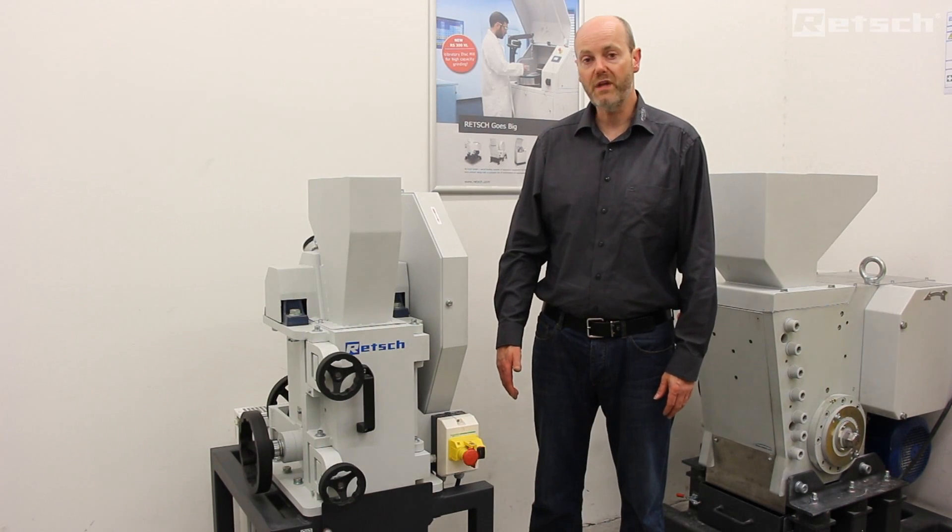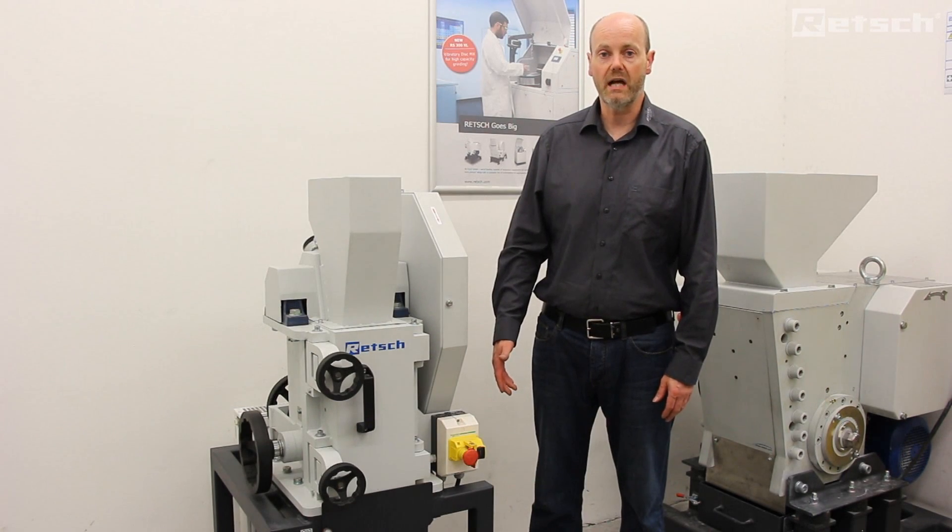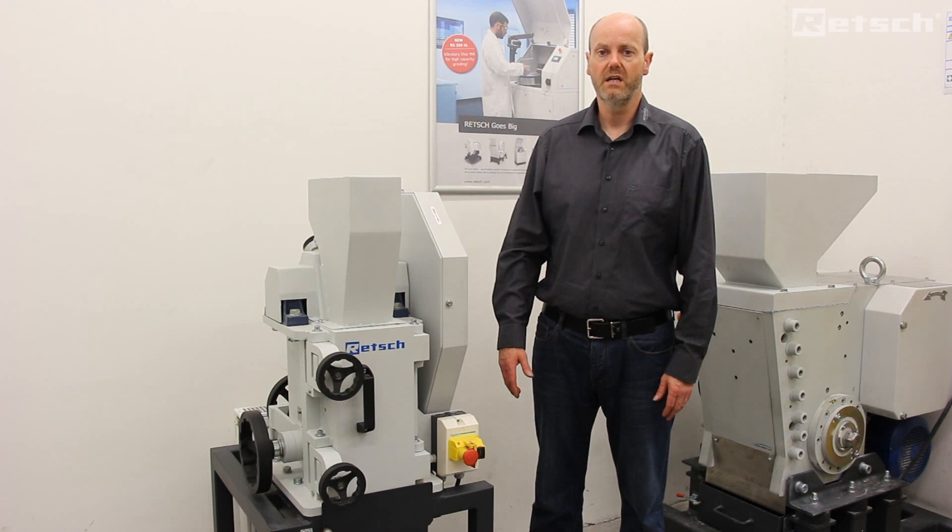I trust that you found the overview of the BB250 XL to be very useful. For further detail, please visit www.retsch.com.